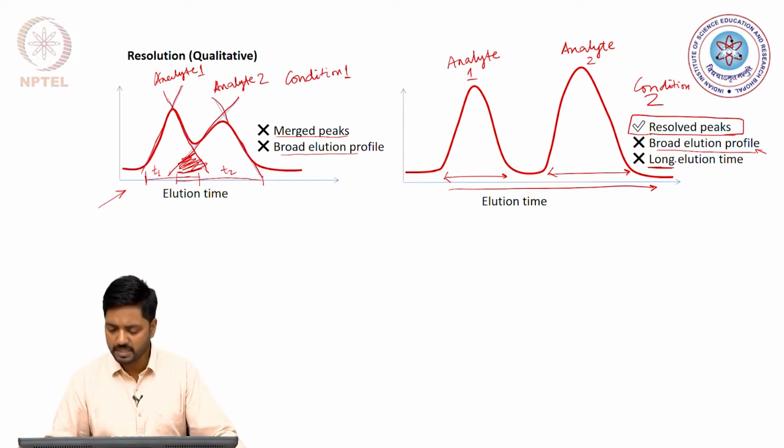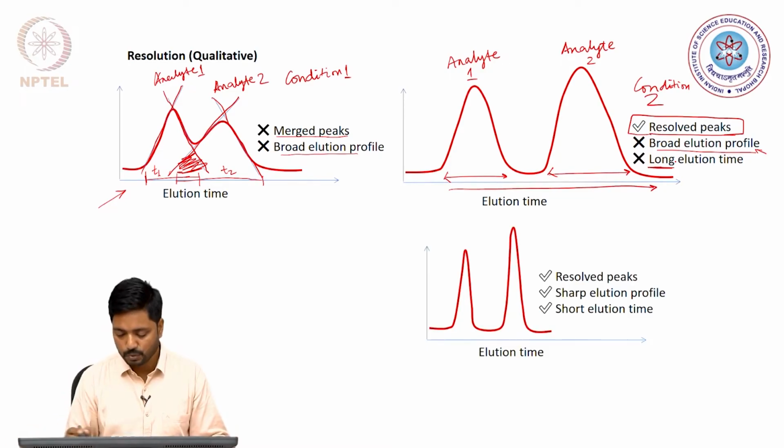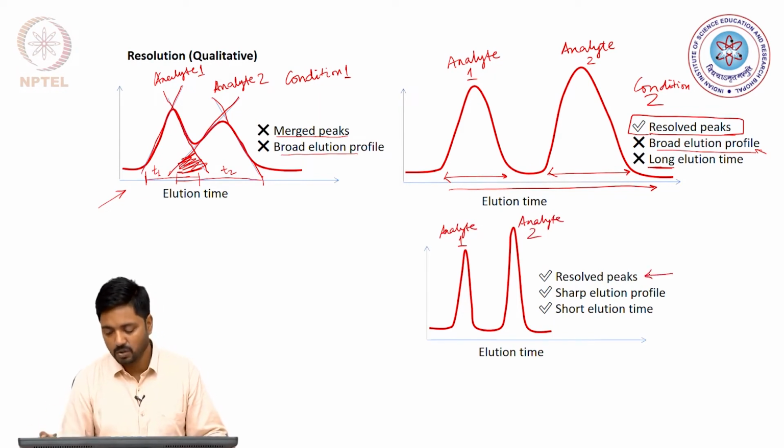Now, the best case scenario is shown here, where the two analytes are giving well resolved peaks, and they also have a very sharp elution profile.